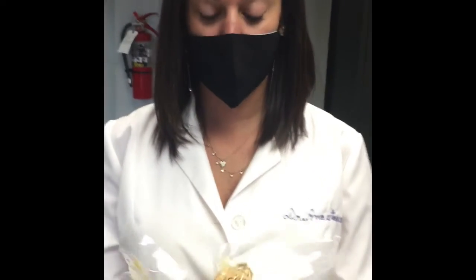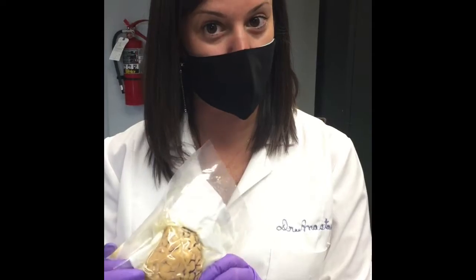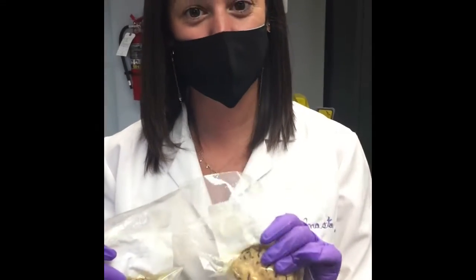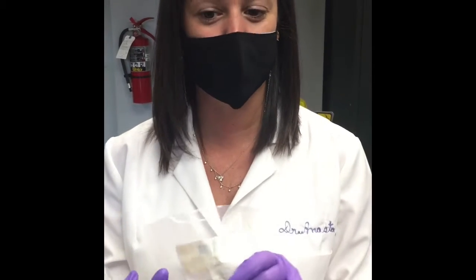Okay, so we are going to dissect a sheep brain, clearly much smaller than our brains, but the anatomy, the structures that we see in these brains are essentially the same as the structures that we would see in our own brains, just on a much smaller scale.